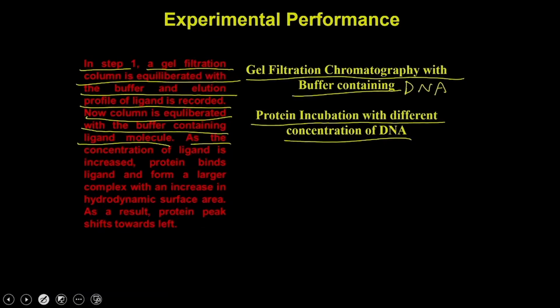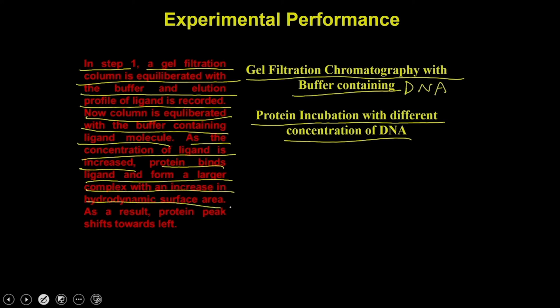So, as the concentration of the ligand is increased, the protein binds the ligand and forms a larger complex with an increase in hydrodynamic surface area. As a result, the protein peak shifts towards the left.